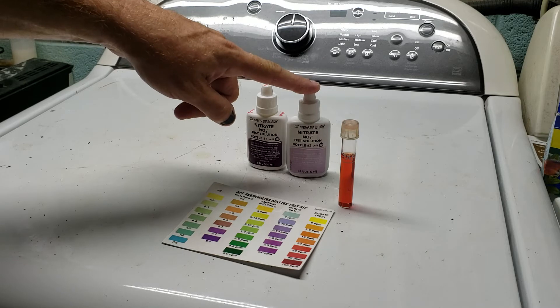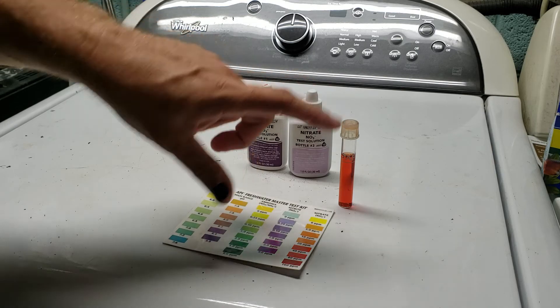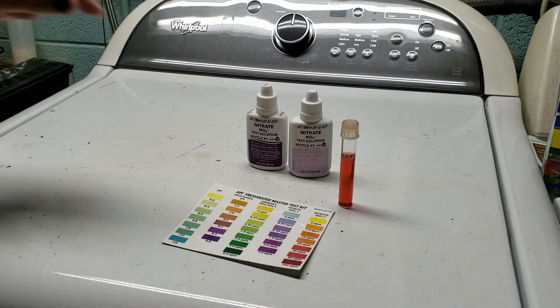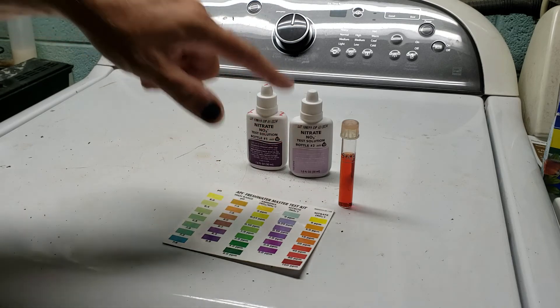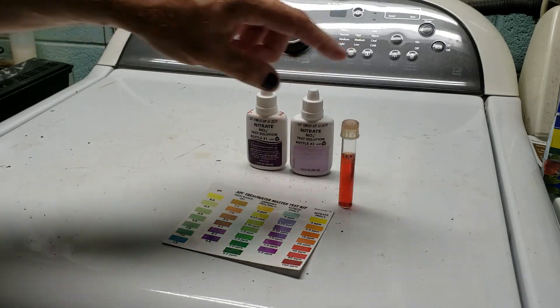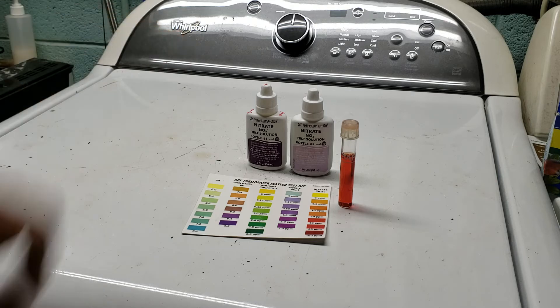The test puts you in the ballpark and gives you an idea of where you're sitting. The really important thing is to shake bottle two vigorously. As far as all the other stuff in the instructions, it's not that critical. If you're skimping on the instructions, do not skimp on the shaking. If you don't shake it properly, you won't get enough reagent suspended in solution, you won't get a proper reaction, and you won't get a proper color reading.